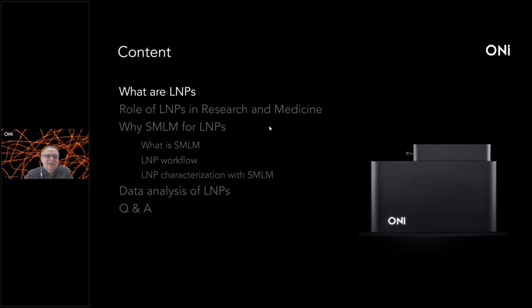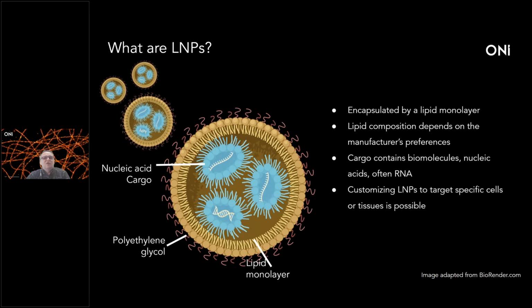Great. So I will give you an insight into how single molecule localization microscopy can very simply help you to characterize and analyze lipid nanoparticles. As I mentioned earlier, let's give a small introduction. What are lipid nanoparticles and how are they characterized? Sometimes these particles can be mixed up with liposomes. However, there is a huge difference between these two particles.